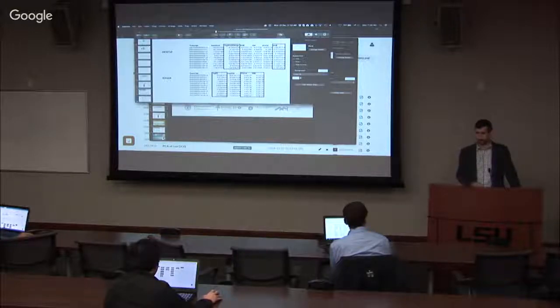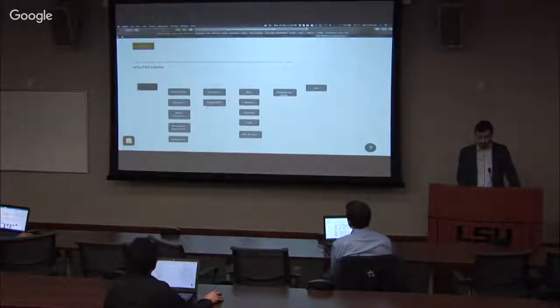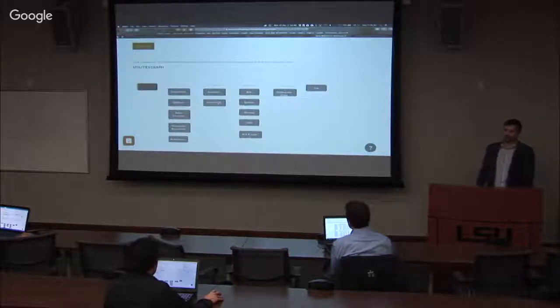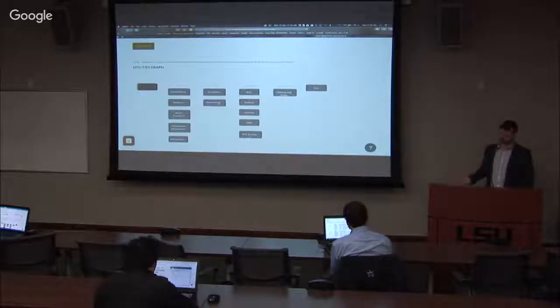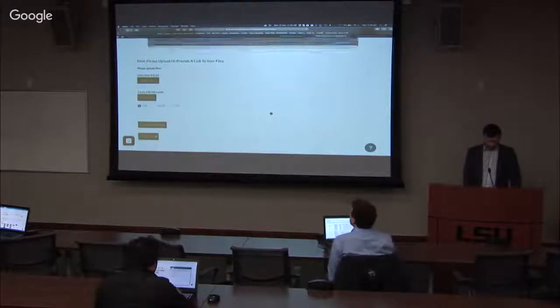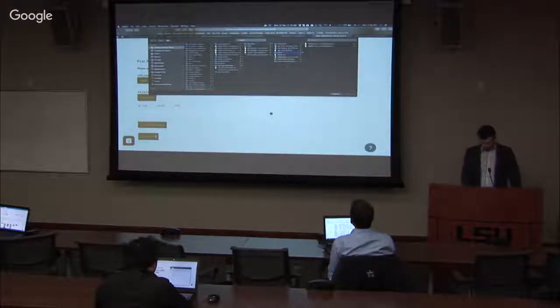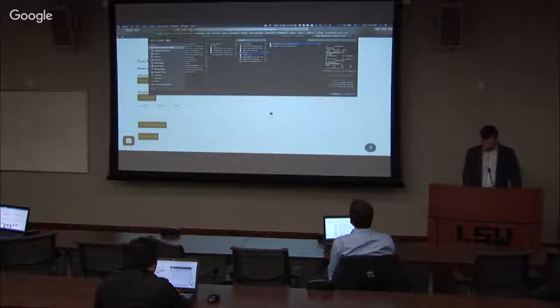So any result from DESeq or edgeR or manually created, you can then also use this GAGE analysis, which is the gene set enrichment analysis, that will actually give you the pathways and produce images of those pathways that you can see up and down regulated genes on them. So to do that, let's just upload the results from the DESeq2, for example. And here again, you have to practice under GAGE. You have DESeq2.